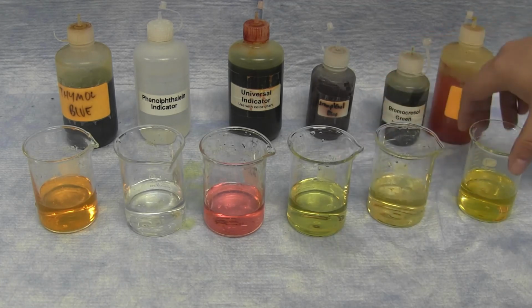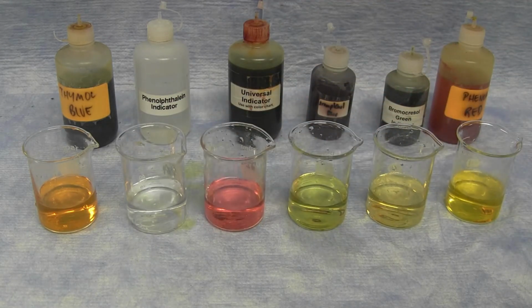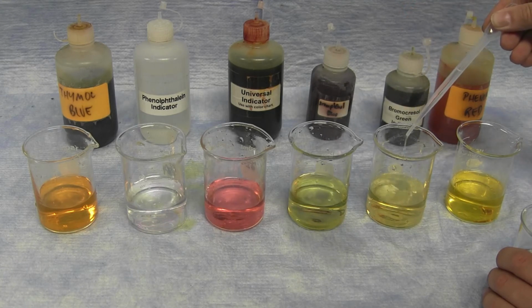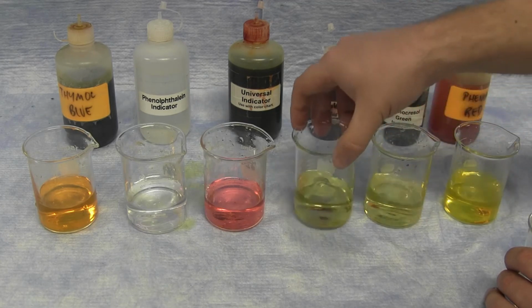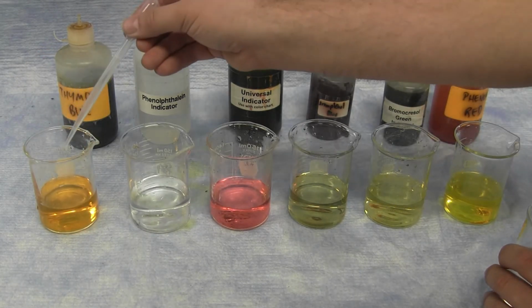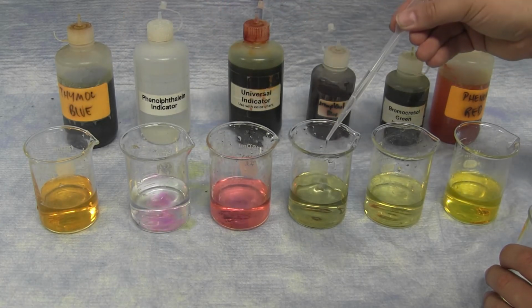They all have their unique color in these particular conditions. However, upon the addition of sodium hydroxide, the color will begin to change. If you noticed, after a few drops, the color starts to change and then instantly goes back.